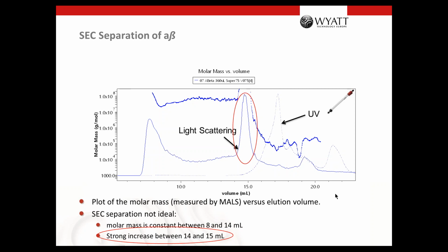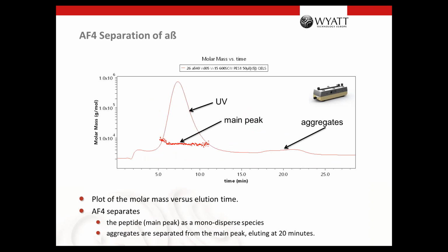And then we decided to measure this peptide, which has a molar mass of roughly 4,600, with the FFF channel. And when you do so, you suddenly see, indeed, a monomer. We have a very nice monomer peak here. We have a very flat, monodispersed molar mass. And so that's a really reasonable separation of the amyloid beta. And you see here the UV trace.